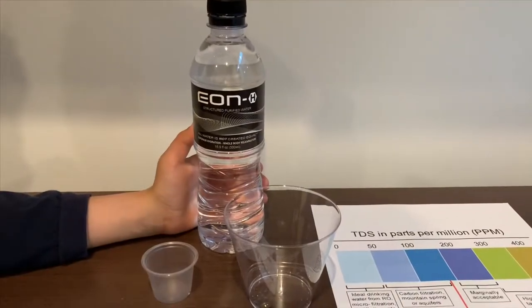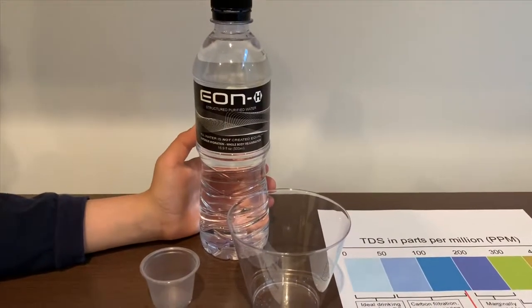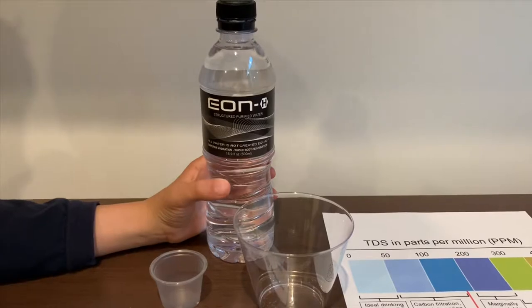This is Eon purified water. It costs $149. Let's test the pH and TDS levels.